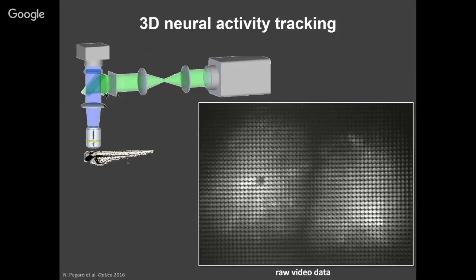And we want to decompose it into which neurons are on at once. So we needed an extra step. You can clearly see that stuff is happening. This is the video we have to reconstruct in 3D. And stuff is definitely happening, but this is definitely not sparse. There's a lot of white space here. We needed to deal with the lack of sparsity because it was killing us. If you're not sparse enough, then our algorithms don't work very well.